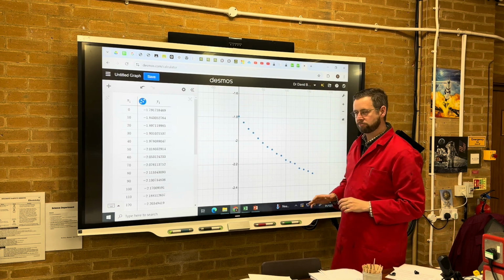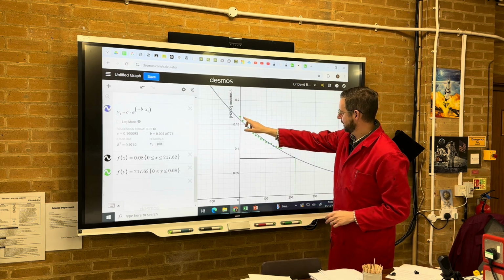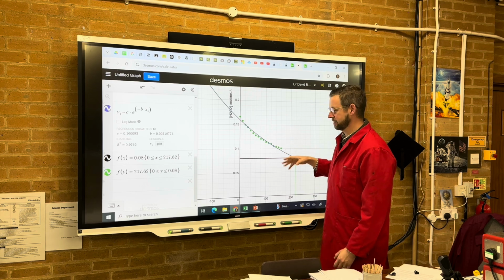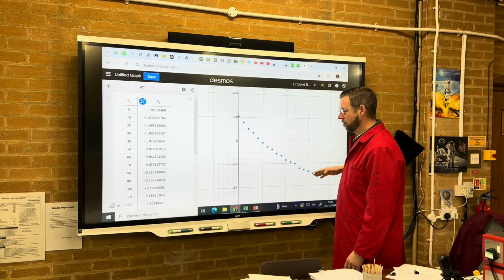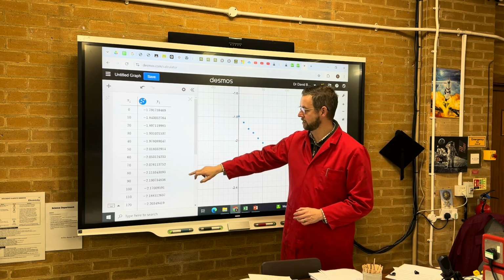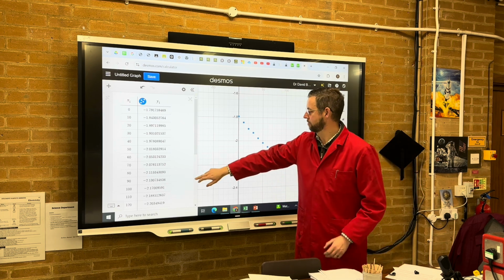Now technically, you would imagine it to be a straight line, but I want to point out that this line isn't exactly following our data. You can see that it is shallowing out slightly, and it is not exactly as straight as you'd like. But anyway, what we're going to do here is find the y equals mx plus c of this through linear regression.